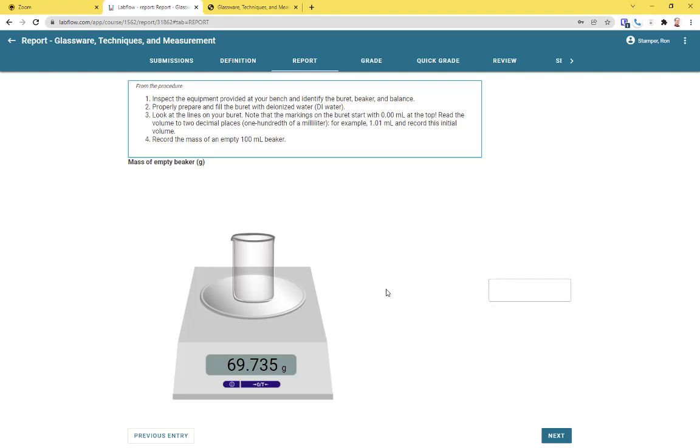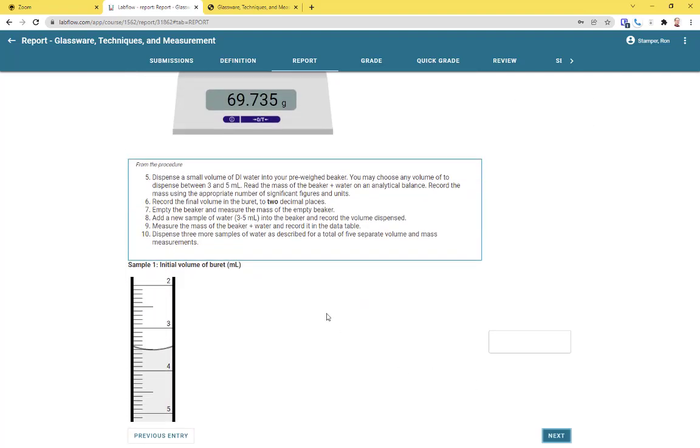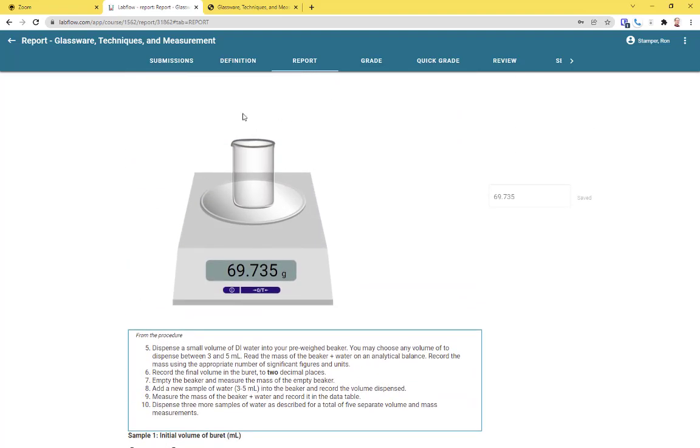Now we're on to a beaker here. As you will see in the video and in the reading, beakers are not for analytical measurements of any kind. They're not designed to be accurate. They're designed to be just an estimation, just to hold liquid.